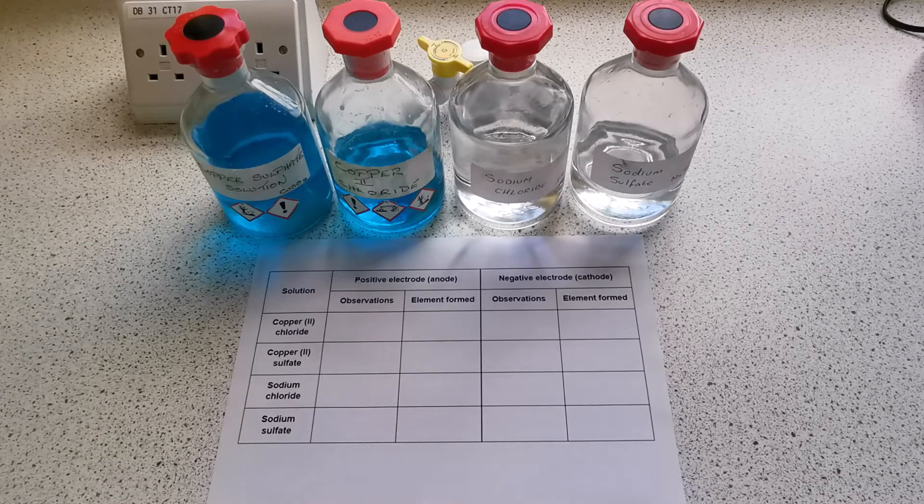Today we're going to be carrying out electrolysis on copper sulfate, copper chloride, sodium chloride, and sodium sulfate solutions, and we're going to be recording our observations and stating what's formed in this table.